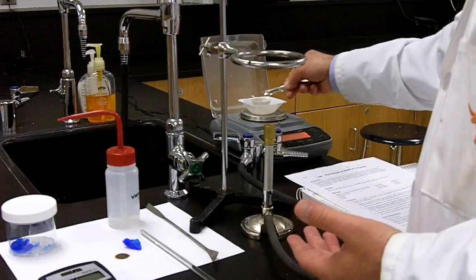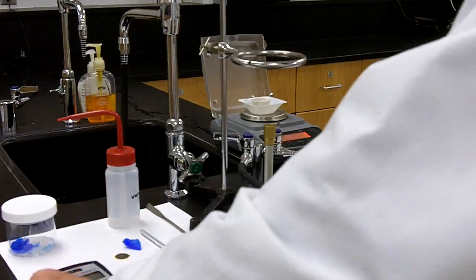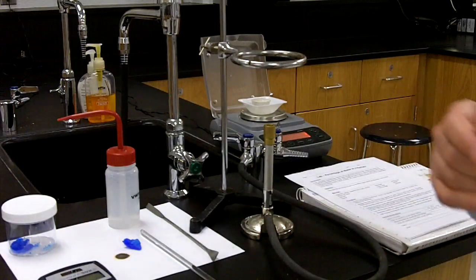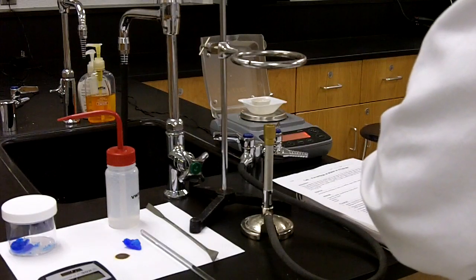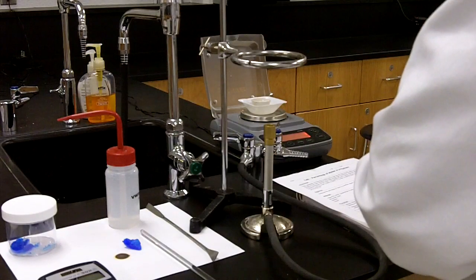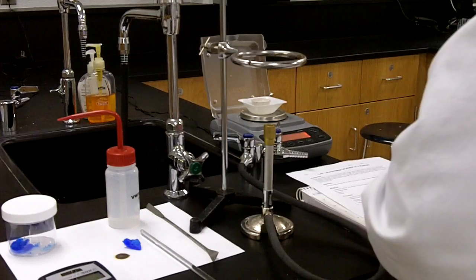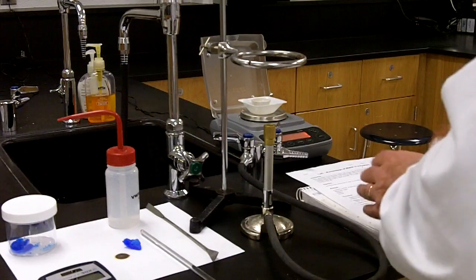So what I'm going to do is place a small piece of copper 2 sulfate pentahydrate into the crucible, and I'll measure once again. And this time I get 12.70. So 12.70 grams for the mass of the crystal and the crucible before heating.